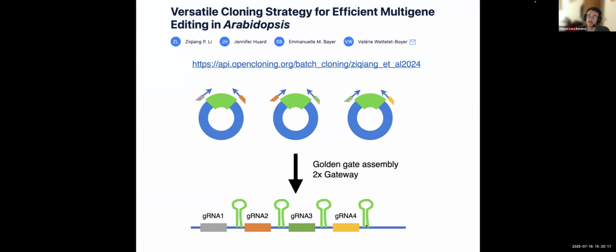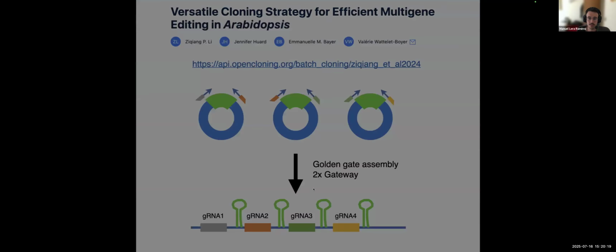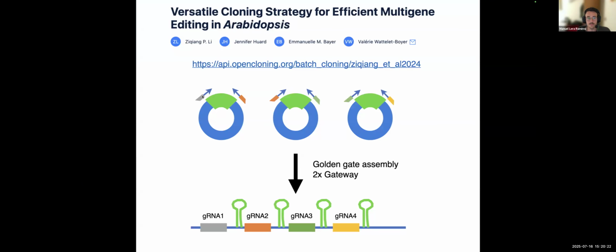And the way they would make them would be by putting these gRNAs as spacers in primers, and they would amplify many times a tRNA motif that is cut inside cells. So basically, you end up with gRNA, this motif, gRNA, this motif, gRNA, this motif, and when this is made into RNA, the cell will cut between the RNAs and release them for the CRISPR to target the different targets.